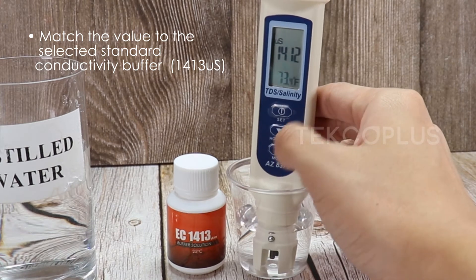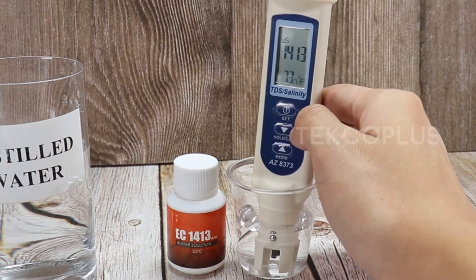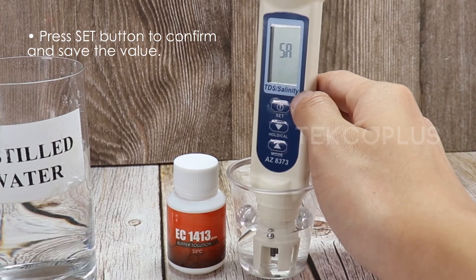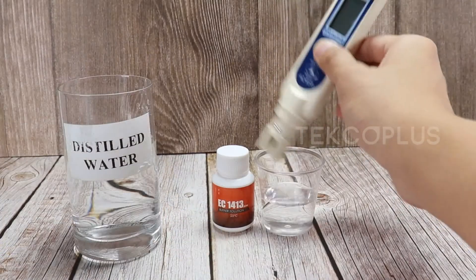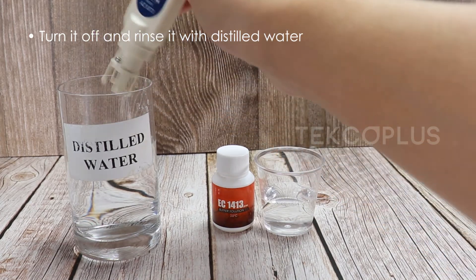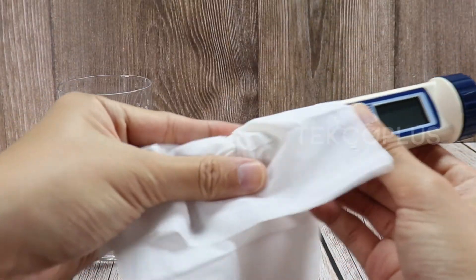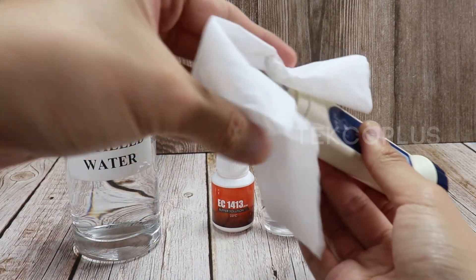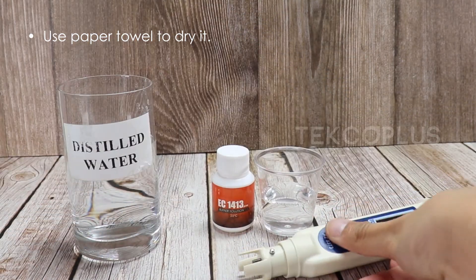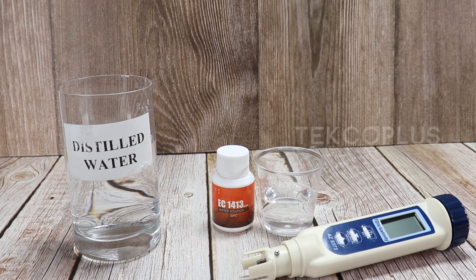Use the up or down button to adjust the displayed value to match the selected standard conductivity buffer — 1413 µS. Press the set button to confirm and save the value. Turn it off and rinse with distilled water. Use a paper towel to dry it. The calibration is done.